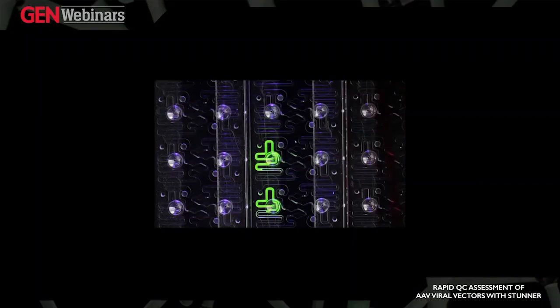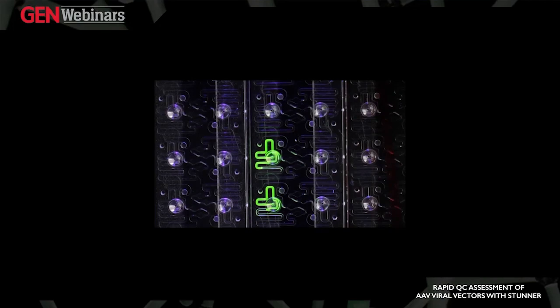Here we can see exactly what sample loading looks like with the help of some fluorescein and a black light. In 2 wells, we've already added fluorescein, and as you can see, to load another sample, you simply add 2 microliters into that input well, and the sample wicks into the plate.